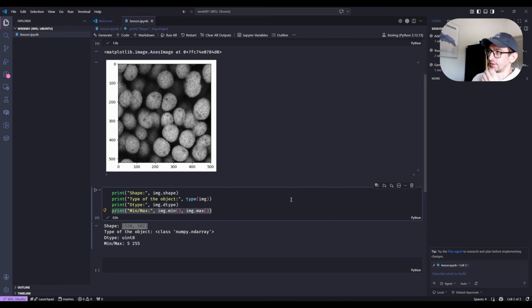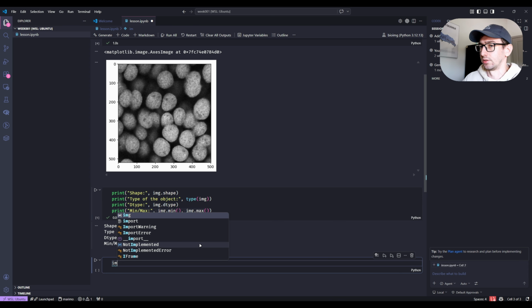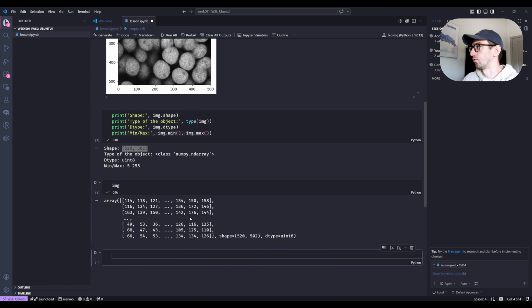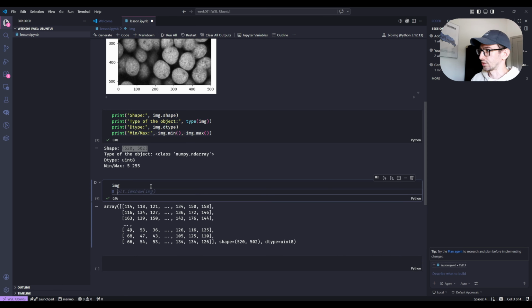Okay, so let's try to execute the following task. The idea is that, as I said, this is just an array. If we run it as an image without any function, you can see this is an array, a 2D array. Let's solve the following task.